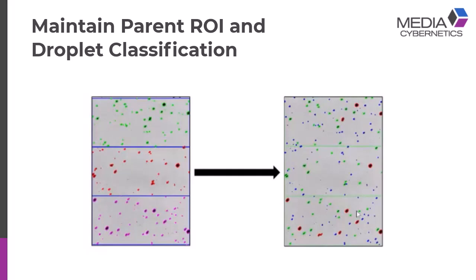Classify objects within regions of interest. So the question is, how do we get from count by ROIs to actually doing classification within each of these regions? It's actually following the same principles we've already shown and learned. Draw our regions, or use grids to create regions, and put those on the image and count by ROIs.